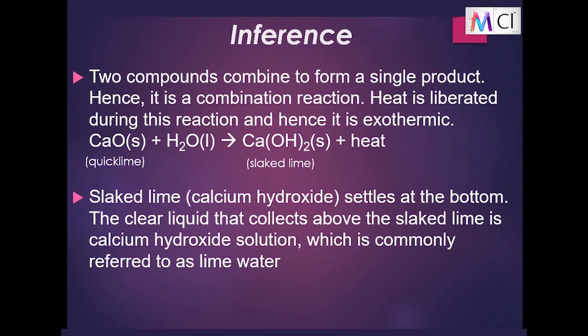Slaked lime, that is calcium hydroxide, settles at the bottom. The clear liquid that collects above the slaked lime is calcium hydroxide solution, which is commonly referred to as lime water.